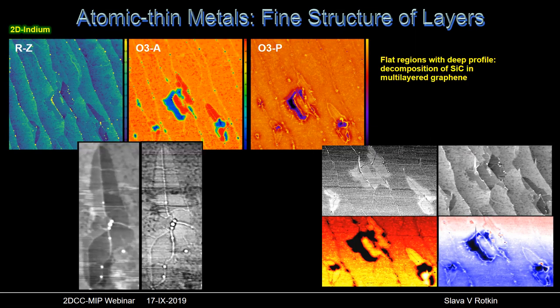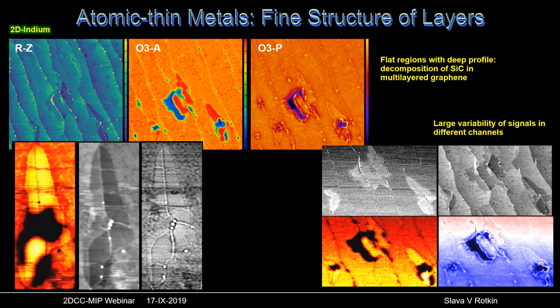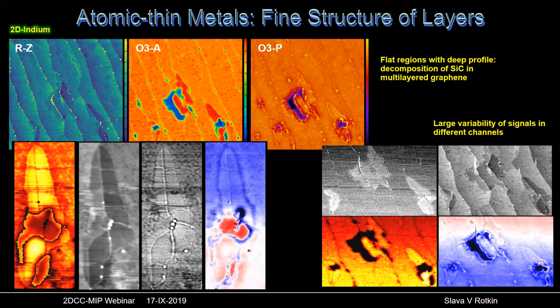So when you get deeper, which means that the graphene is probably thicker, the optical contrast is higher, except for the regions where the intensity of the optical signal is almost gone. So we have to magnify this intensity 20 times to get some resolution. And also the difference in the phase indicates that most likely it's either an oxidized area or an area where the 2D metal is absent.